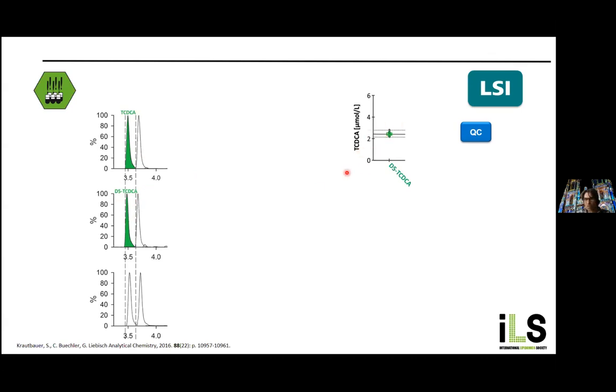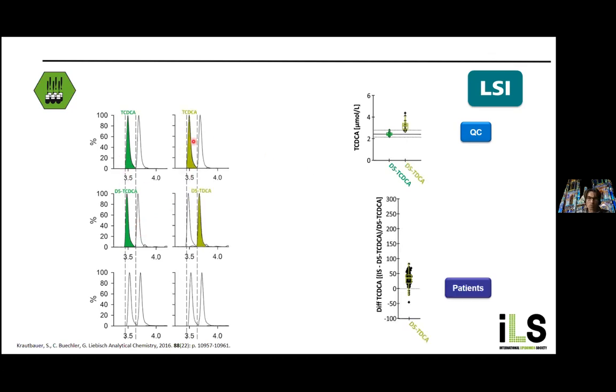This is, I think, 13 different batches. Sabrina now did calculations using other internal standards. In that case, she used another Tauro conjugated, but isomeric compound, a DCA, and you see you get not only higher variation in your controls, but also a shift in accuracy.